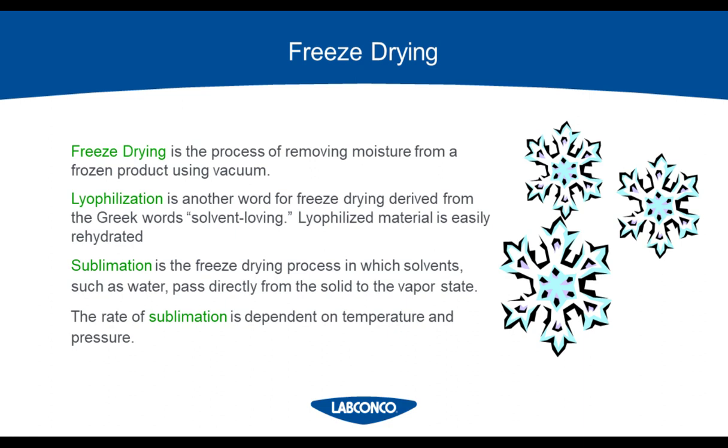Sublimation is also a word you'll hear when talking about freeze-drying. This is the process in freeze-drying in which solvents pass directly from the solid phase to the gas phase, giving freeze-dried samples such great preservation properties because you are bypassing the liquid phase. The rate at which sublimation occurs is dependent on temperature and pressure.